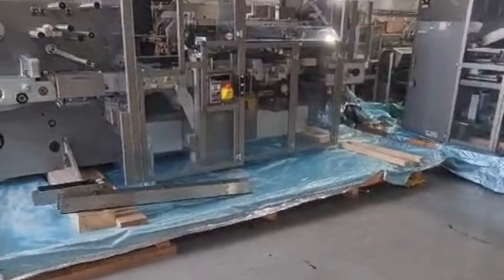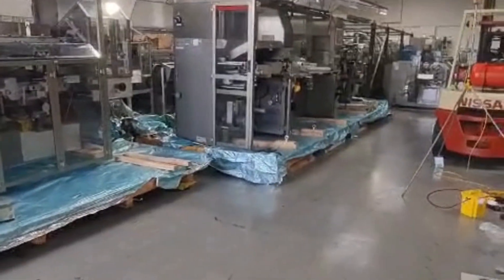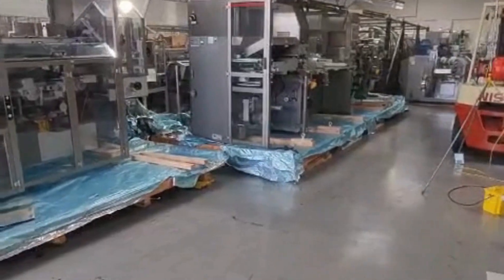In stock and immediately available: the IMA C80 blister line.